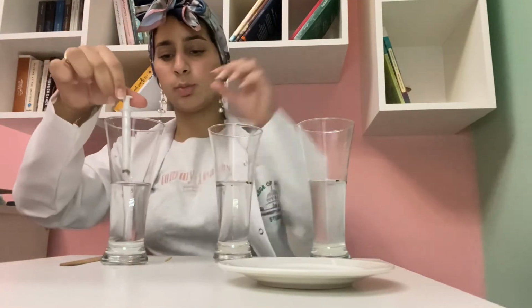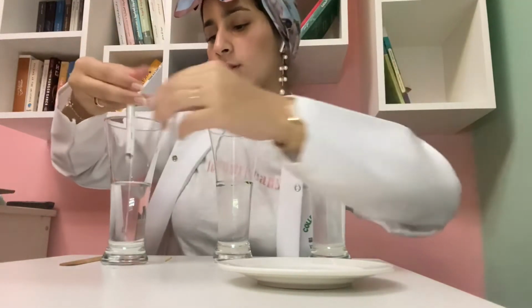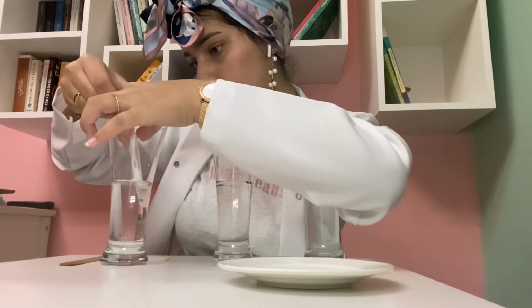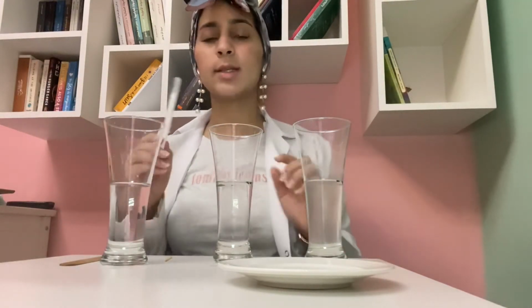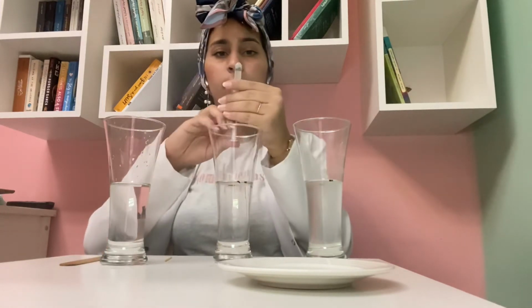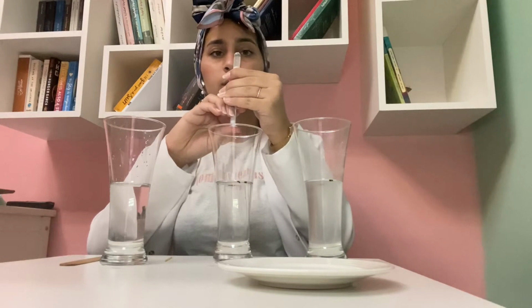Now we're going to add some water, 2 milliliters of water. In this way, we're doing a vacuum. What happens in a vacuum is that the gases inside the air sacs of all of the discs will be removed. It will be replaced by this solution, which makes the discs more dense, which makes them go down. So in order to make them sink, we're going to do a vacuum using the syringe.